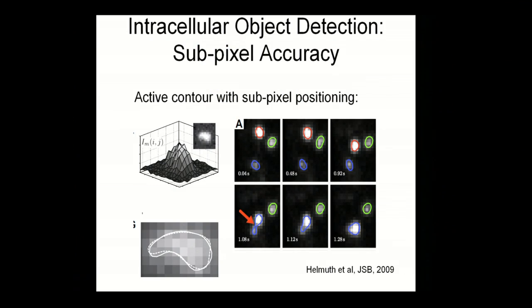So in 2009 another approach was offered by Zurich University, which uses active contours at sub-pixel resolution, where you put an artificial force to keep it. You know the idea of active contour, so maybe I will not go into detail, or I have to. This is a question which I asked the auditorium. The auditorium doesn't answer, which means they need some explanation.